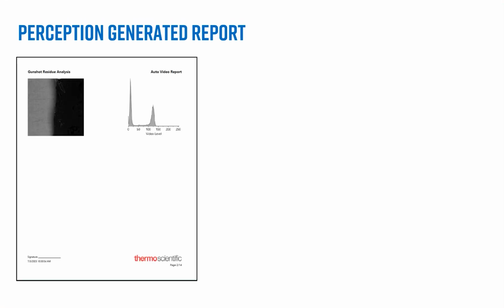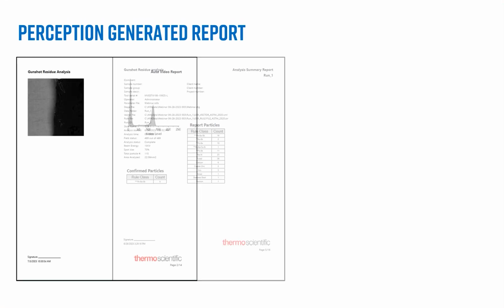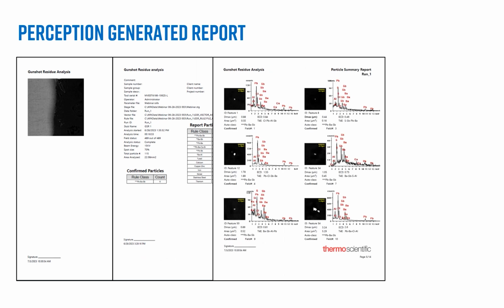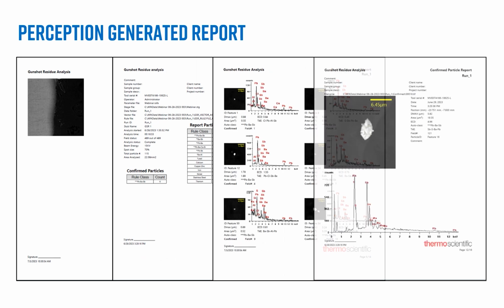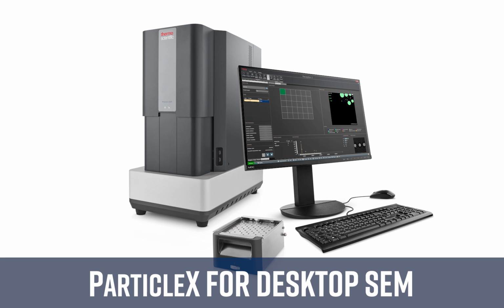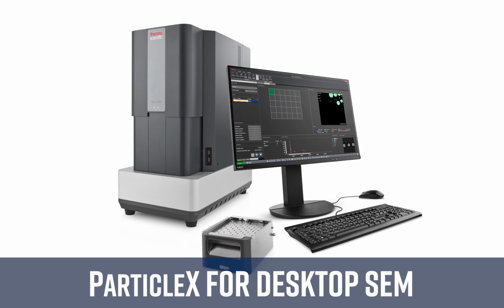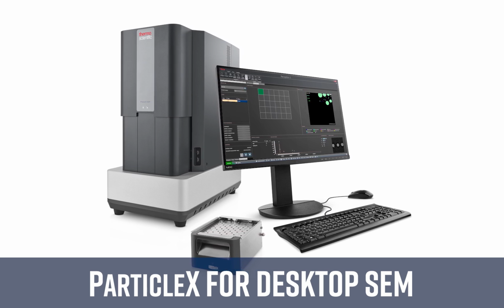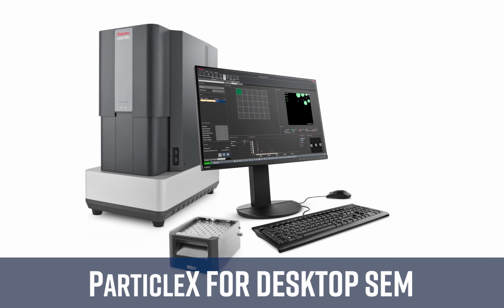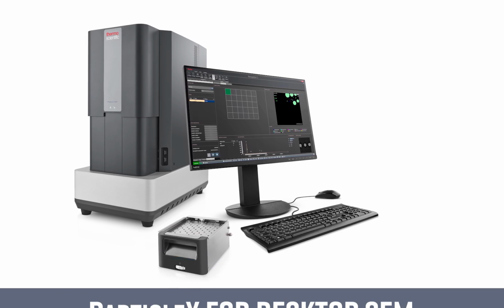By standardizing workflows and minimizing human error, automation ensures consistent, high-quality results while also meeting regulatory requirements. The Phenom XL desktop SEM is uniquely positioned for this, as beyond being designed for ease of use, speed of workflow, and no user maintenance, the ParticleX software package unlocks easy, reliable, automated GSR particle analysis.